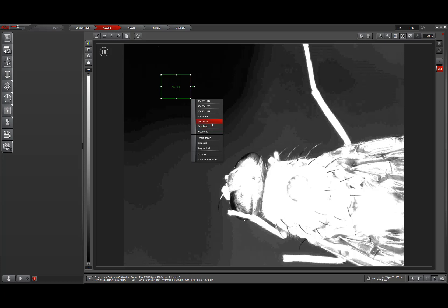The one change from this that can be a little bit confusing is now that this ROI is selected, to get rid of it, I simply click this trash can up at the top that says delete ROI.